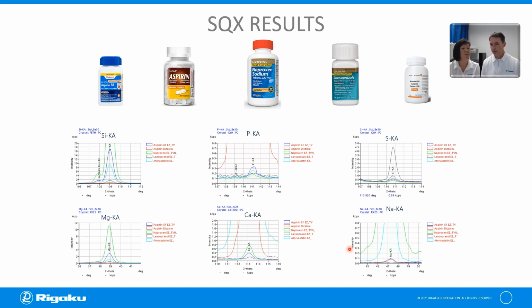And speaking of that, we know some cement companies are using aspirin as their binder. Right, in a cement. So they might want to make sure that if they're going to stick with using one aspirin, they don't use a different one, because it's completely different, since there's a lot of calcium in this one versus using this.